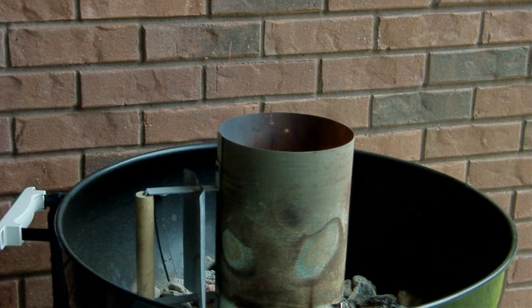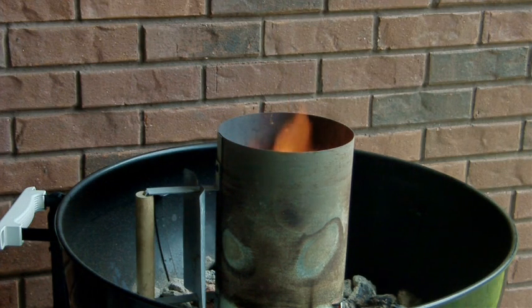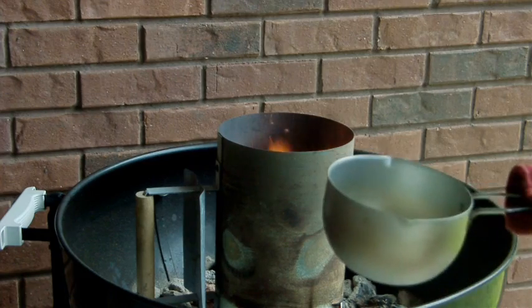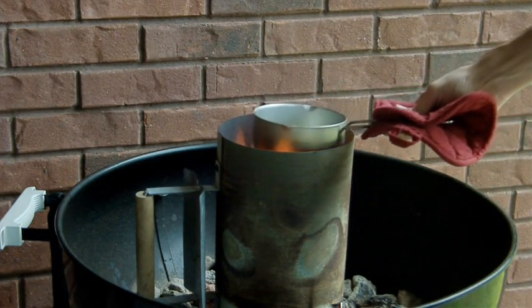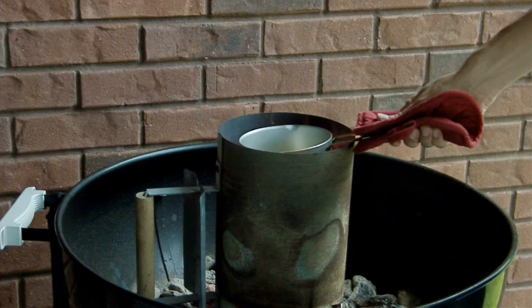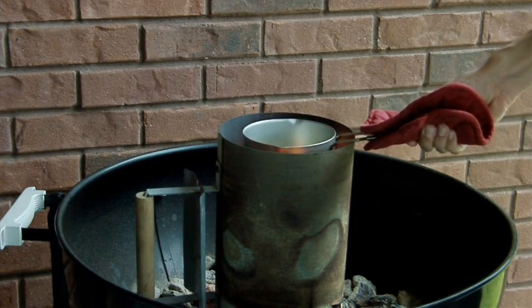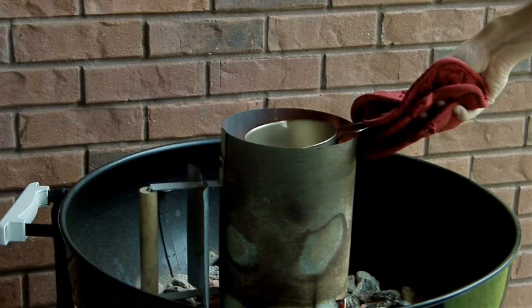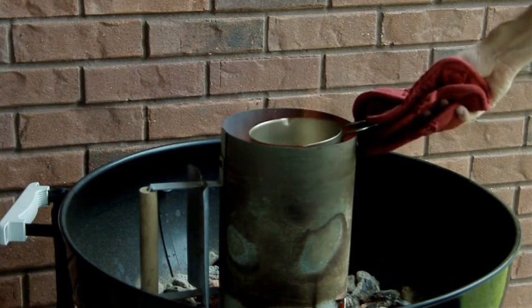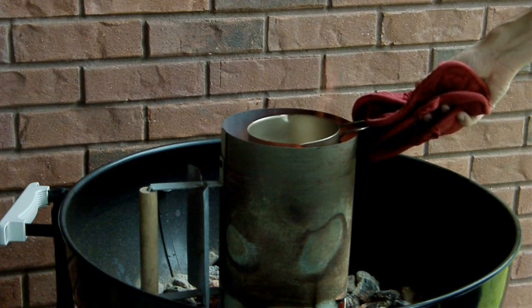Here we are in my makeshift backyard furnace — it's just a charcoal grill. I'm going to take the copper carbonate and carbon mixture and suspend it over the fire for 15 or 20 minutes. This should initiate the reaction between the two, which will produce carbon dioxide gas and copper metal. As the reaction proceeds, you can see the whole mixture darkens as, hopefully, copper metal is being formed.